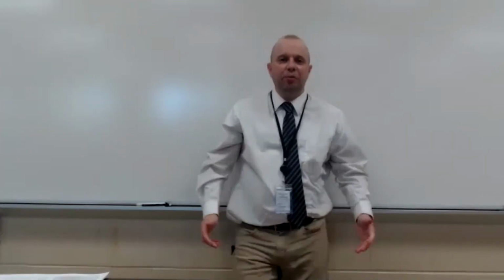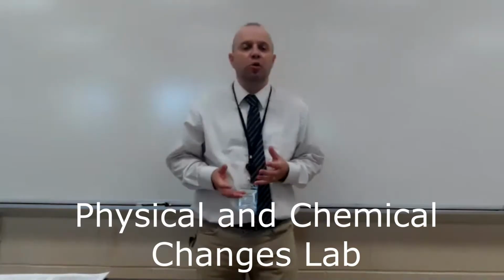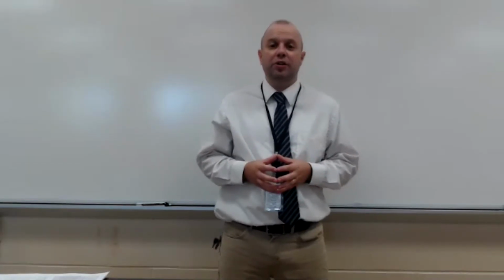Hi everyone. Today we're going to talk about the physical and chemical changes lab. I'm going to go over each of the little mini experiments that we will be doing for this recording, and I'm going to pause after each one so that you have time to decide whether a physical or a chemical change has occurred.